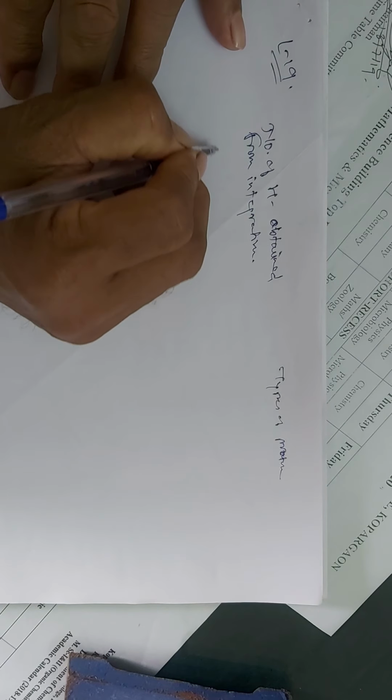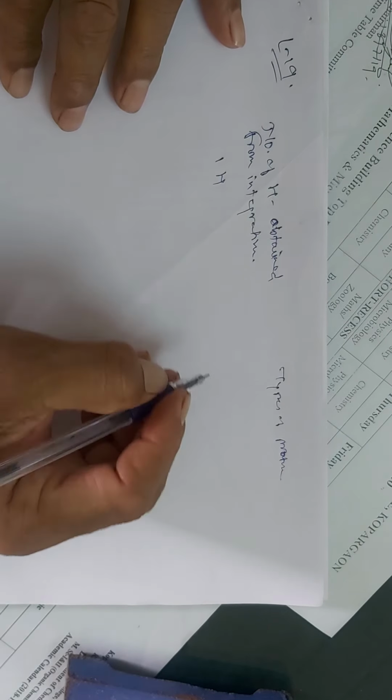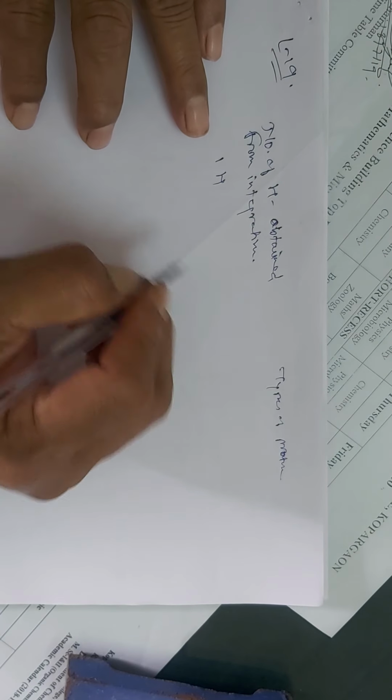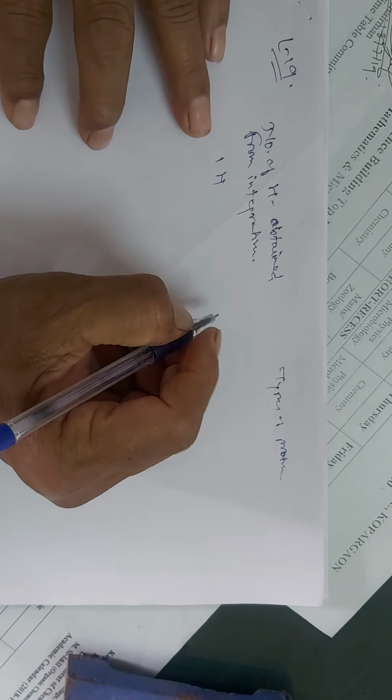Means here when we are getting the integration for one proton, if only one proton is obtained in the integration, the peak is responsible for only one proton. And so what type of groups may be present?